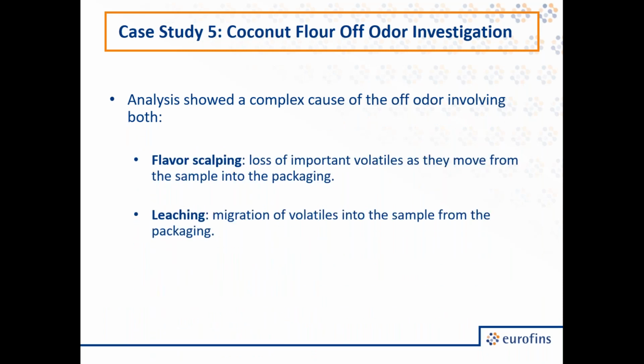So these results show that there's likely a complex cause of off-odor in this case, where we have both flavor scalping and leaching that are happening. So this is likely a packaging issue. Potentially, it just isn't compatible with their products, because it's clearly both contributing volatiles and removing volatiles, which is leading to that funny aroma.